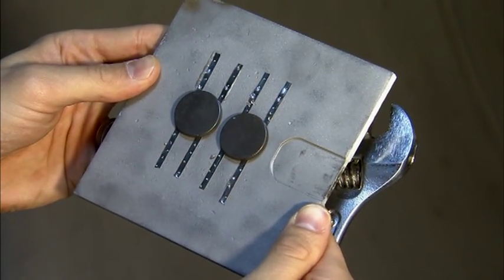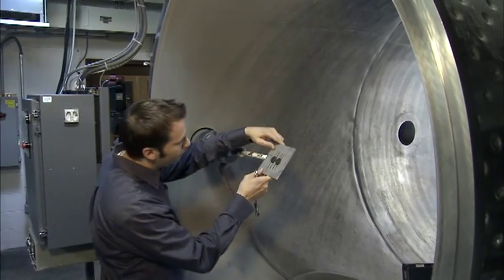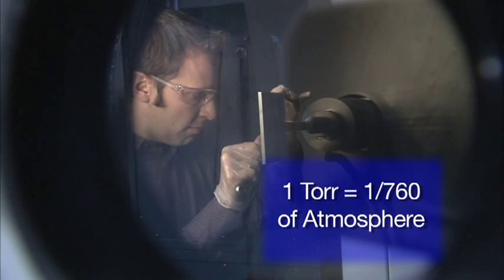During our run process, our samples are mounted to a metallic plate, which is then loaded on our sample mounting arm. The chamber is closed and the entire system is evacuated to a pressure of 1 torr, which is 1/760th of atmosphere.